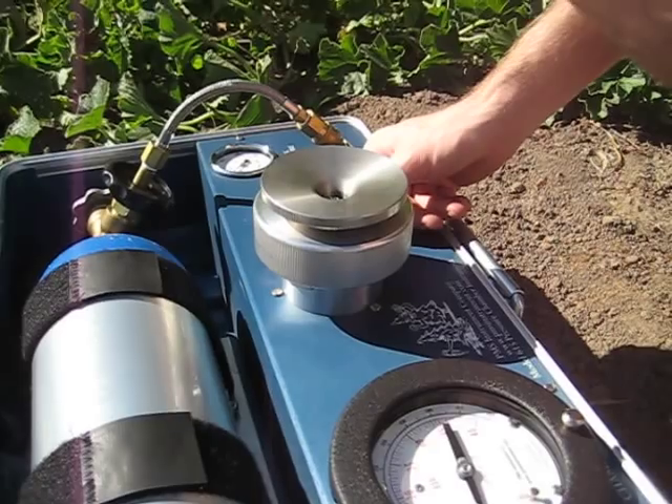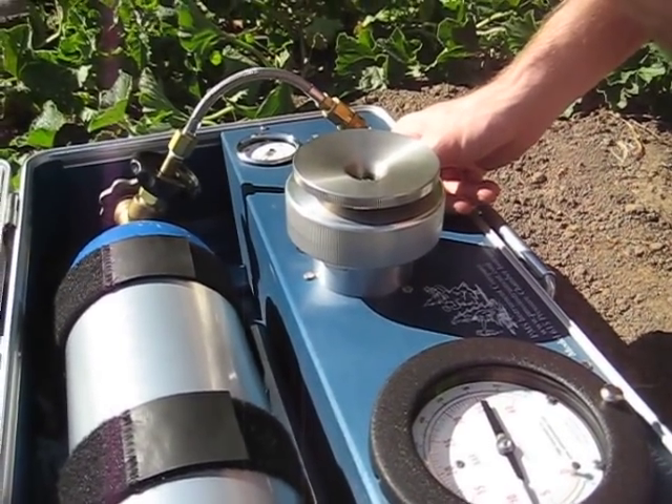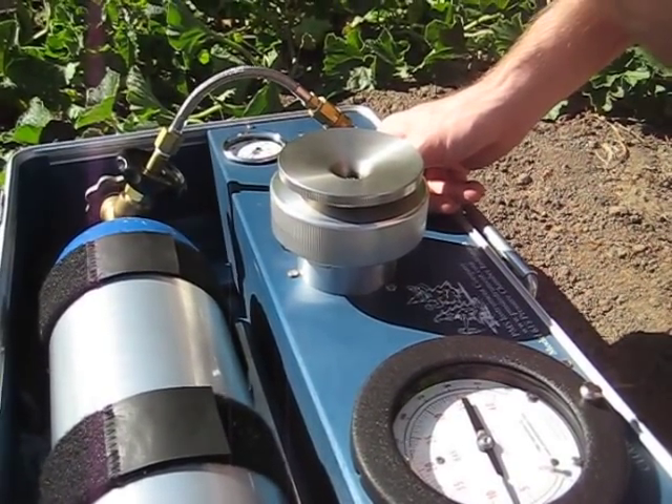Just cut that back and do it the same way as you would normally with a pressure chamber. If you have any questions about measuring corn, you can contact us at pmsinstrument.com.